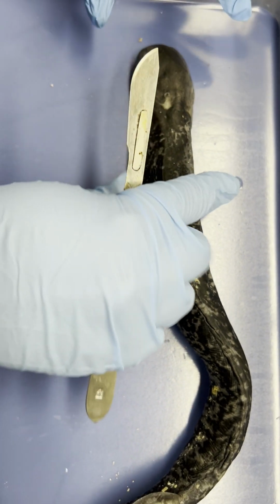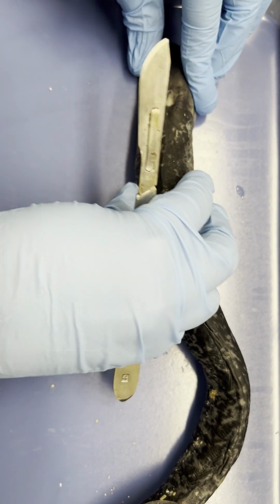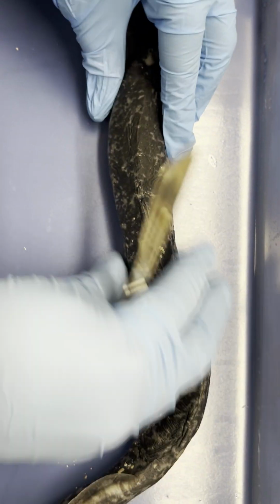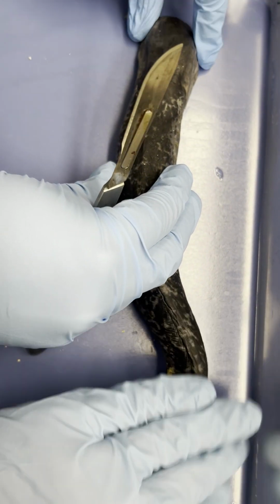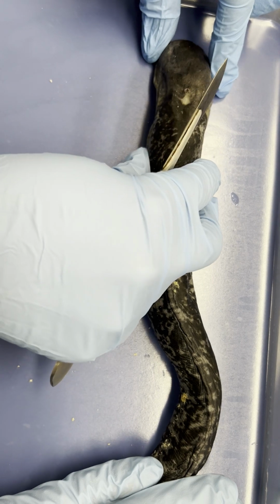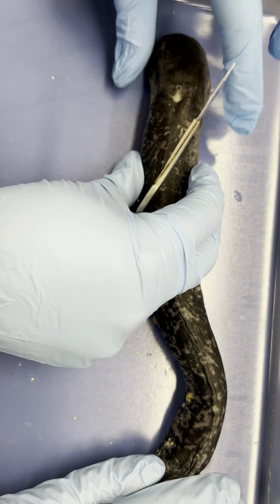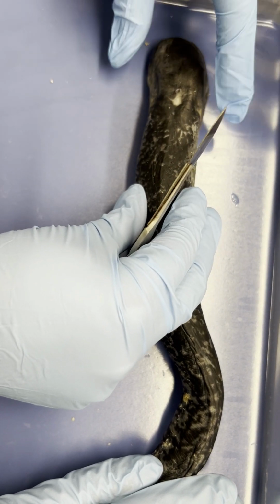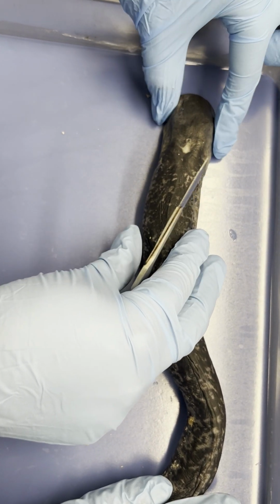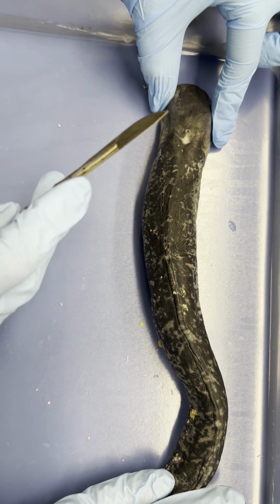So what we're gonna do is it'll probably be good if you have a couple of your group members holding the animal, so that way we're holding it in place to limit our, thank you, Dr. Mason, limit our chance of going off midline. And then I would advise holding with your non-dominant hand at the part of the animal where you're about to cut. You want to take your scalpel.